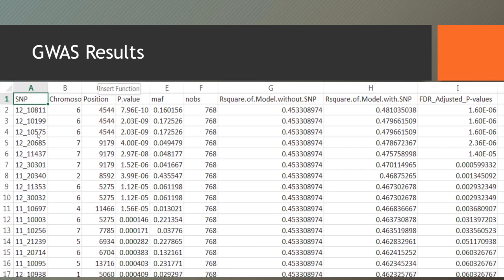Here's what you're probably most interested in, these are the GWAS results. It lists the SNP, the chromosome position. It gives you a raw uncorrected p-value, and I guess caution about whether or not you want to use that as your significant value. The nice thing about GAPIT is it also gives you the FDR adjusted p-value, and the FDR is based on Benjamin and Hochberg and the method they use. GAPIT also reports the minor allele frequency. And one of the options that you can use is you can filter the results based on minor allele frequency, and so you can set it like 5%, so you'd see that these lines would be removed, or these results. It also gives you the number of observations that were used, and then the R-square of the model without the SNP and with the SNP. So obviously the difference between these two values is the R-squared of the SNP, and in some cases it would be the R-squared of the QTL.